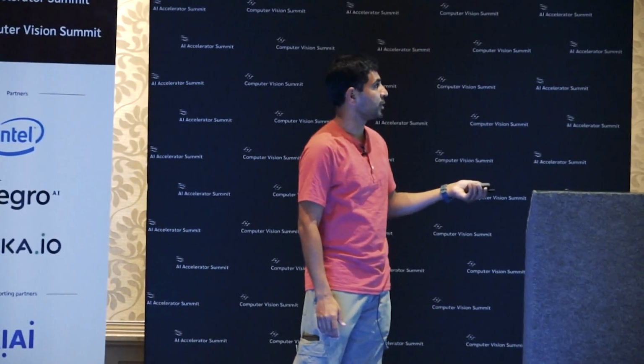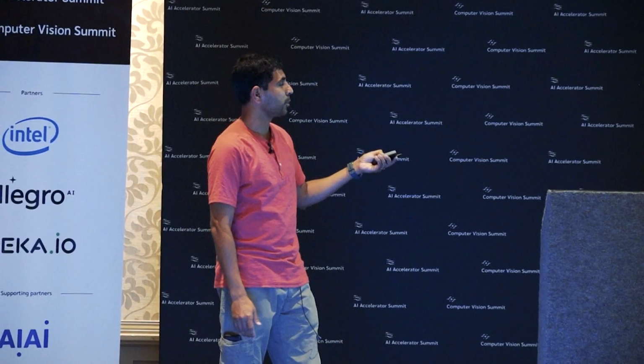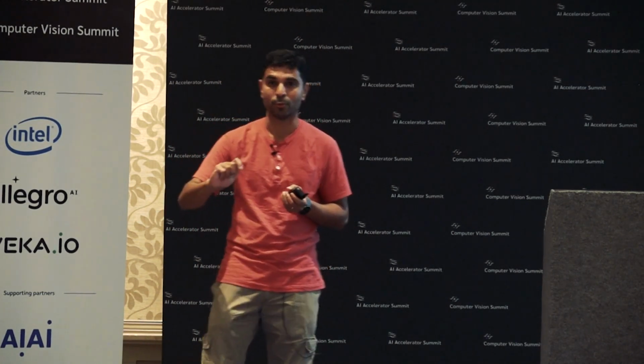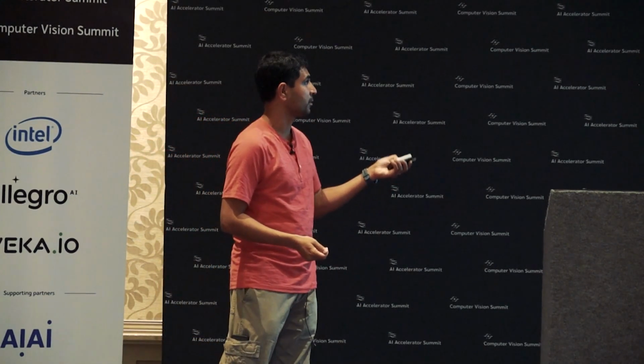So fluorescent microscopy essentially falls under the category of optical phenotyping. Phenotype is a term that is used to represent how a particular structure is changing with perturbations. Like if you're changing the media, for example, or if you're giving it a dose, or if you're doing a genetic perturbation, if you're creating a mutant, what happens. So that's what people refer to as phenotypes.